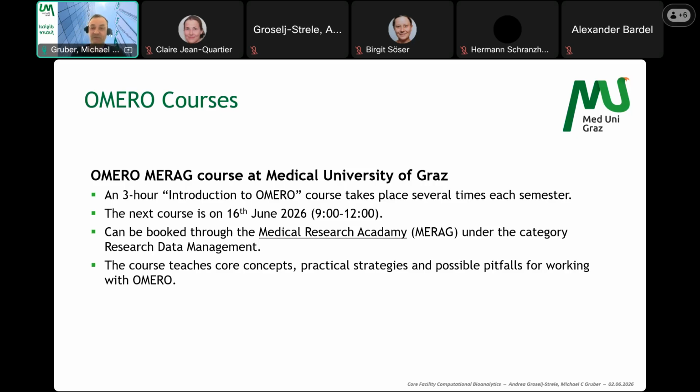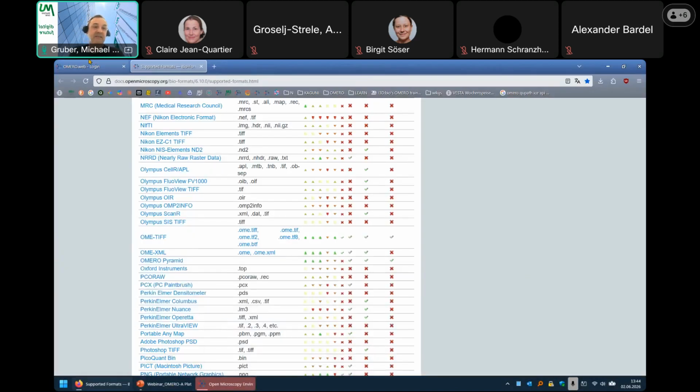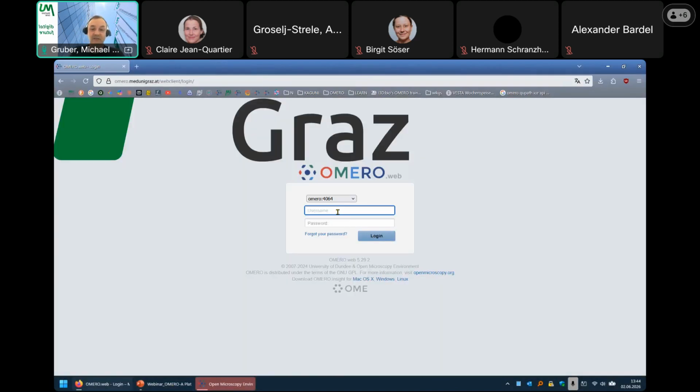So this was it with the presentation so far, and I will now log into OMERO.